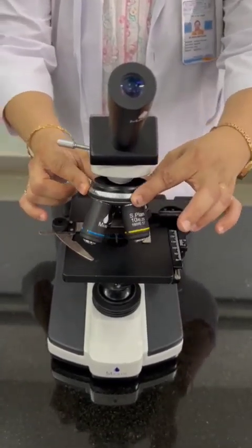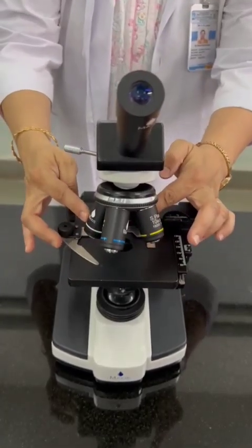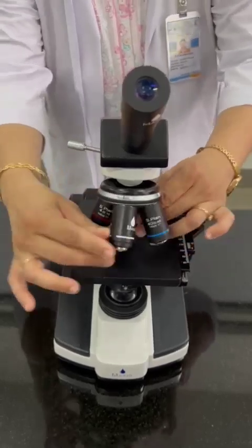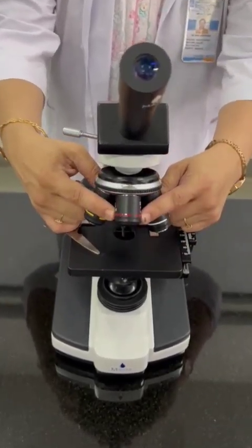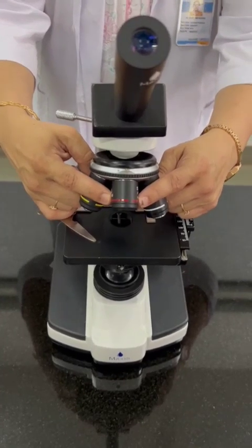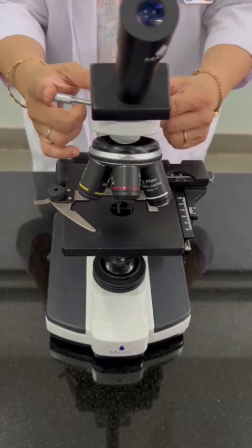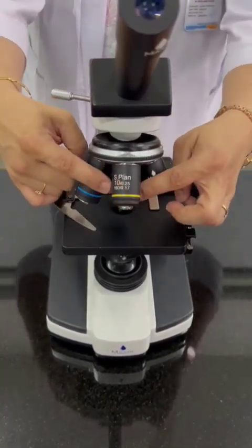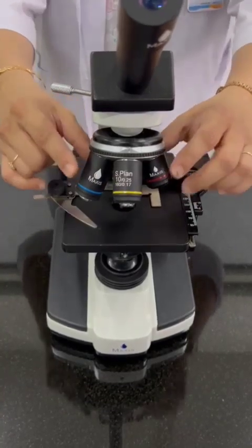The revolving nose piece will house n number of objectives. Now as you can see here, they are color coded. We can see here, this is the red color. So this is the scanner view. It may be 4x, where X stands for magnification, or 5x depending upon the manufacturer. Then we have the low power objective, which is shown by the yellow ring, that is 10x or 20x according to the manufacturer.